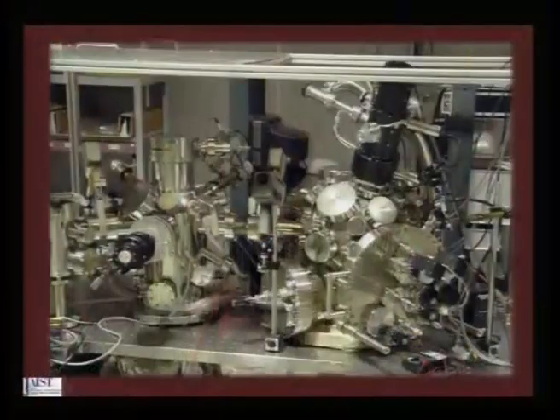And in ultra high vacuum STM, most of the time it is only done at room temperature. But today, as we are addressing this issue, in 2011, we have much more refined techniques where you can even go to liquid nitrogen temperature to probe scanning tunneling microscopic images. So, the instrumentation has become very extensive, and more improvisations are coming, and as I go through some more slides, you will understand that STM or scanning probe has now become a family of techniques. It is not just STM, it has taken upon itself many modifications. Therefore, STM is not a standalone technique, but a group of techniques that can be used.